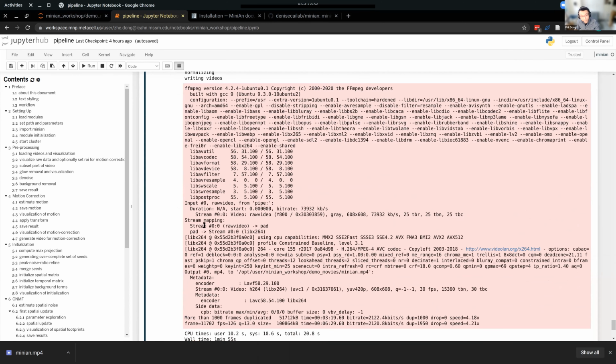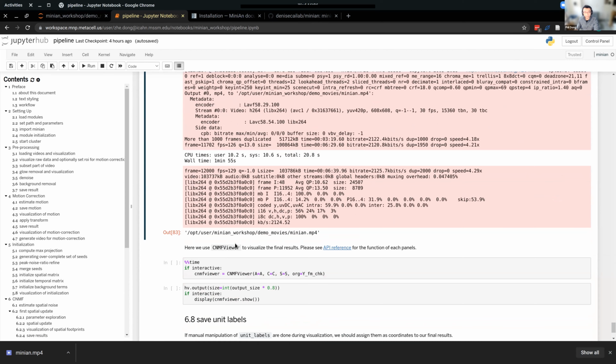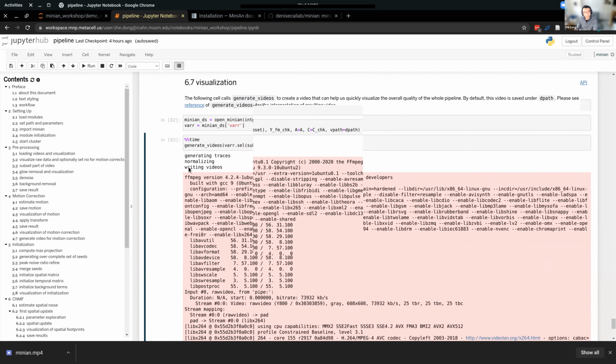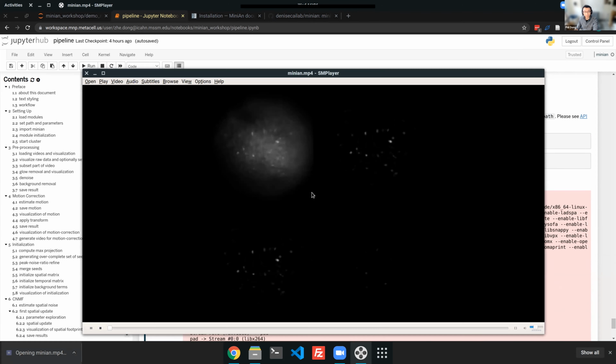There's just two more things I want to show you to visualize the final result and make sure everything is working properly, or potentially manually dropping or merging some cells. So the one thing is this generate video visualization, which will give you a video that you can download.